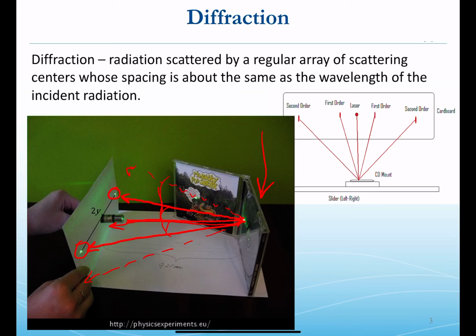Okay, so in other words, the incident light onto the compact disc can give a first order constructive interference diffraction intensity at the board. And we'll see that matched on both sides with the same alpha, or same angle theta, I should say. And at some angle later, theta 2, for example, we can get a second order diffraction condition satisfied, constructive interference there, and we can build intensity at the detection board should it be large enough.